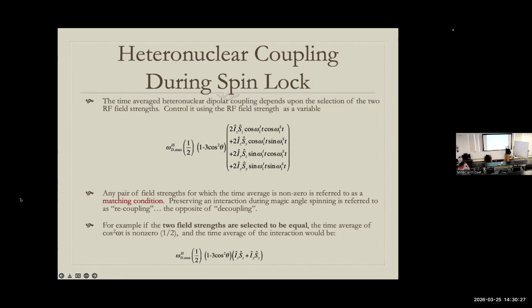We're assuming we're on resonance, so there's nothing funny about it. So the gammas are not equal. To get nitrogen to move as fast as hydrogen, you need to put in more power. There are your kilowatt amplifiers, whereas on proton you should not be using more than, I don't know, 10, 20 watts. You need to really kick the nitrogen so it can move as fast as the proton.